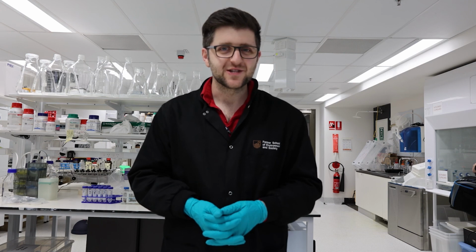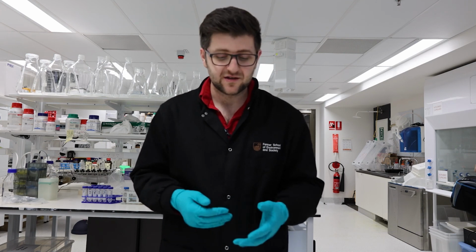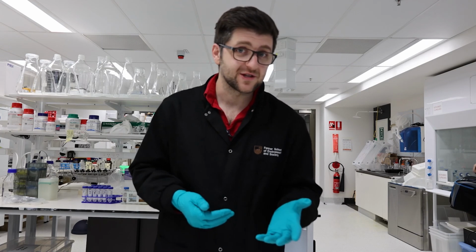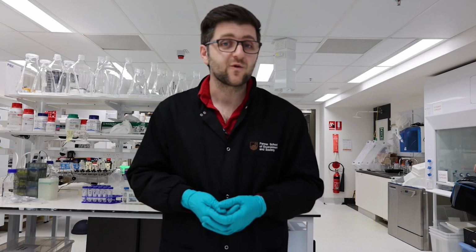Thanks for testing water solutions with us today. You can test all sorts of solutions and determine their total dissolved solids content or their pH. So you can test different solutions at home or around your school.